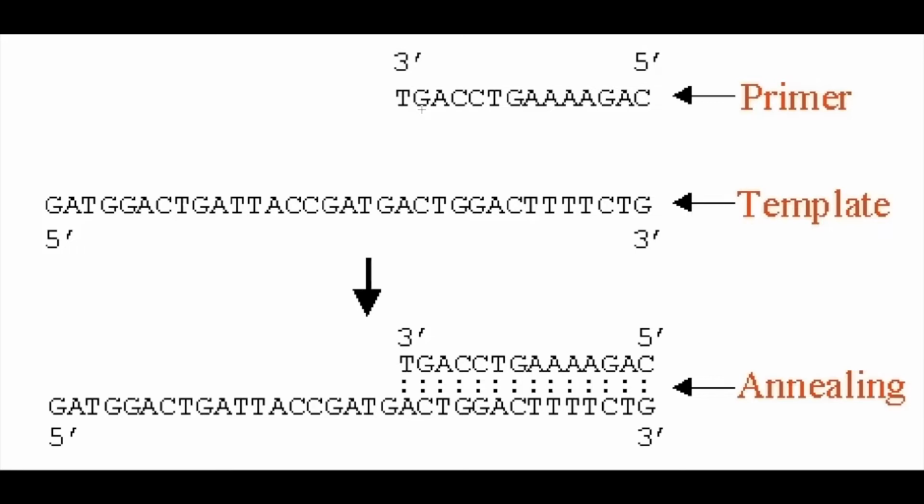or you can use them to analyze DNA by telling apart different versions of different copies. Primer selection and design prove to be one of the most important requirements in order to perform gene expression studies. The designed primers are used in polymerase chain reaction and DNA sequencing. The primer design tends to affect the efficiency and sensitivity of PCR.